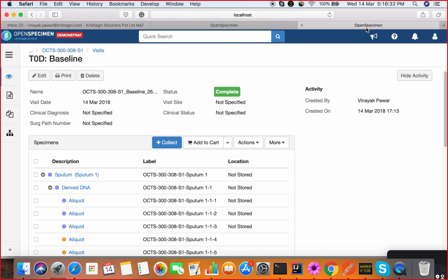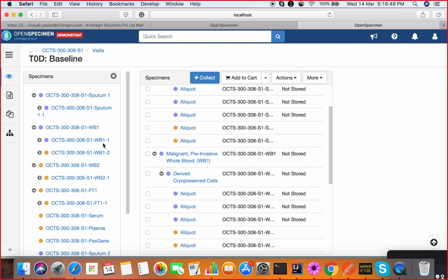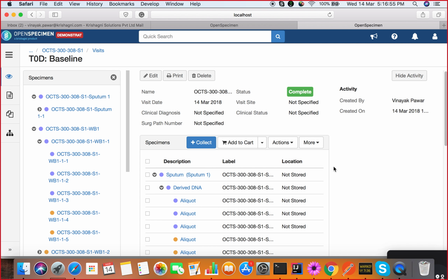So in order to work the quantity and all that you specified? Yeah, let me show you, those quantities also get updated here. See, for example, I specified 1000, 2000, 3000, something like that, right? And you will see those values will start appearing here.